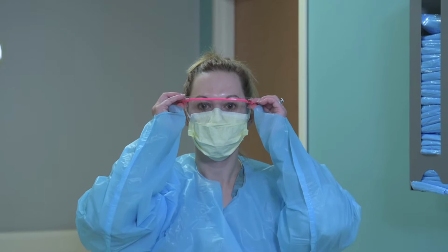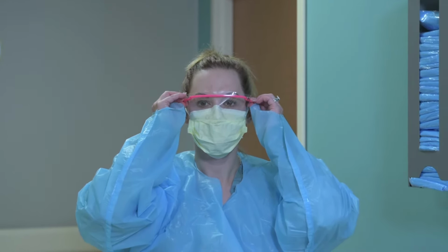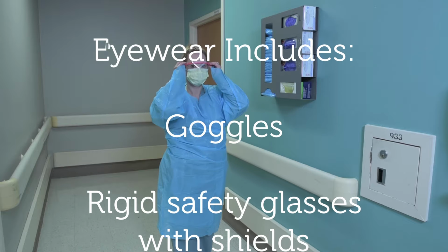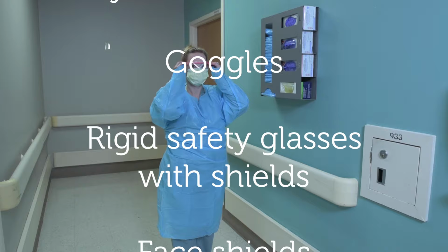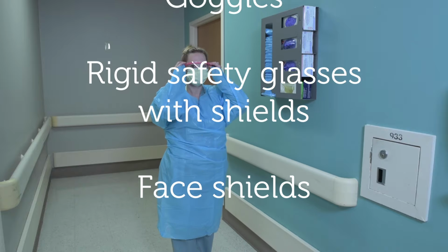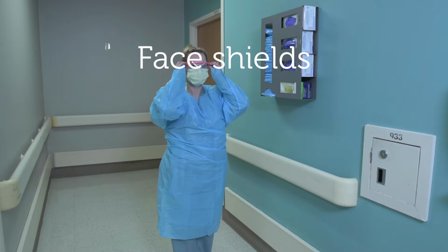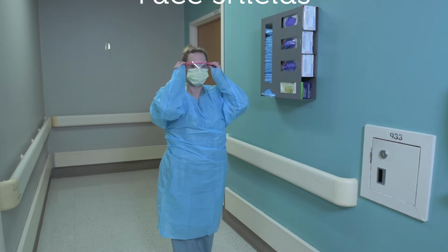Eyewear is worn to protect the eyes from splashing or splattering of blood or body fluids. Eyewear includes goggles, rigid safety glasses with shields, and face shields. Regular eyeglasses without side and top shields are not considered to be adequate PPE.